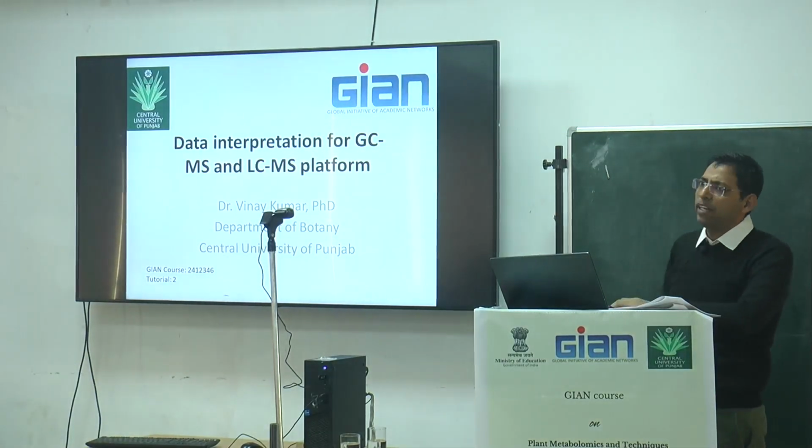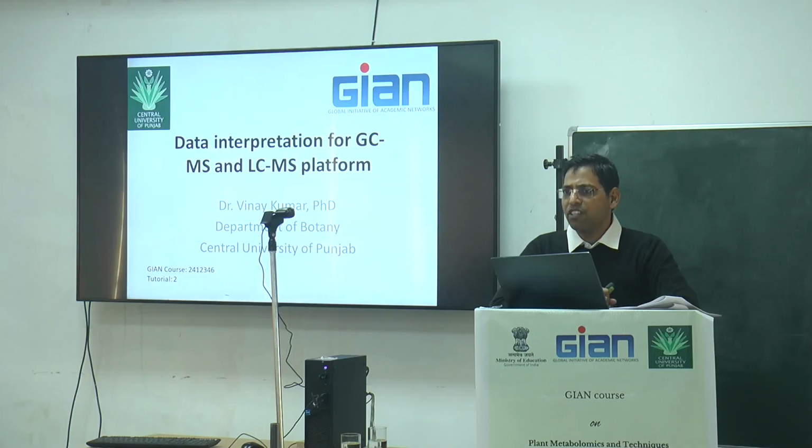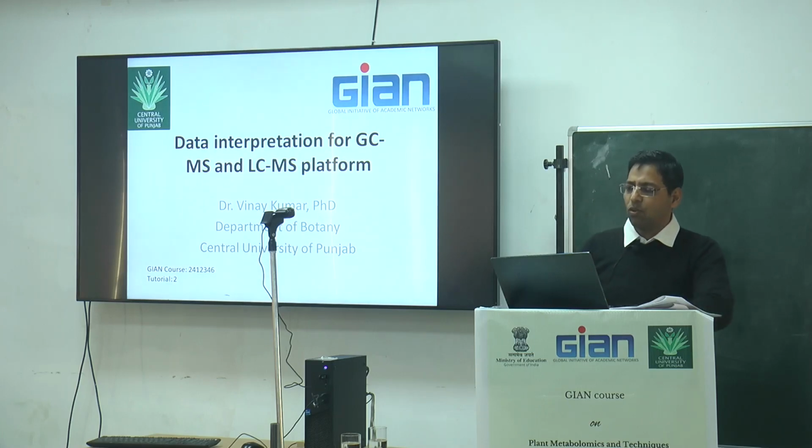So now I am coming to another part, that Professor Jain told us about: what are the LCMS and the GCMS platforms. I will not discuss the LC and the GC here. I will discuss the different platforms and different software we are using for metabolite analysis. This course has 4 to 5 different components.